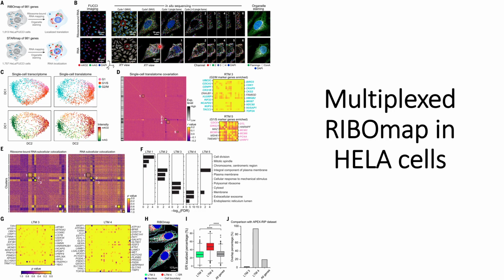These three are for the single cell cycle images, and with the zoomed in image, as we can see here, as we go closer, we can see the cells that are labeled with different kinds of fluorescence based on their cell cycle stage.